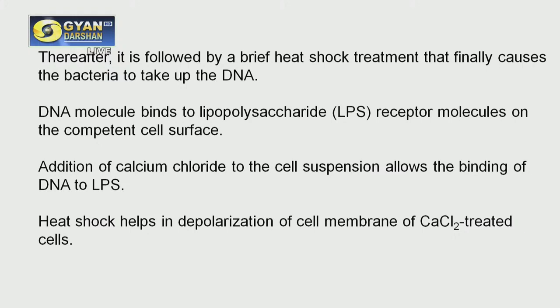Thereafter, it is followed by a brief heat shock treatment. I already mentioned, first calcium chloride treatment followed by heat shock treatment. What happens here is the DNA molecule binds to the lipopolysaccharide receptor molecules on the competent cell surface. Because if you are doing the experiment with E. coli, which is the common model used, then E. coli is a gram-negative bacteria and it has the lipopolysaccharide molecule.